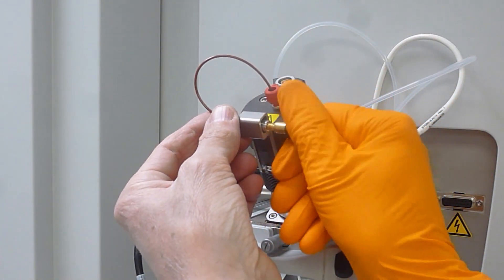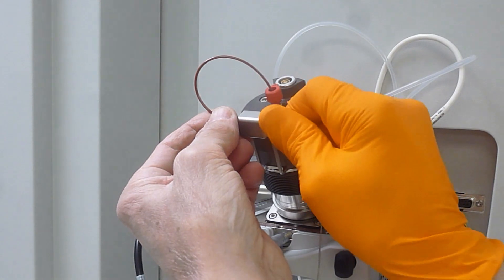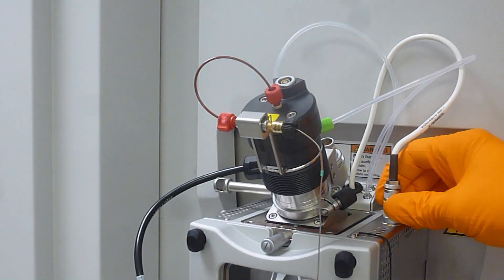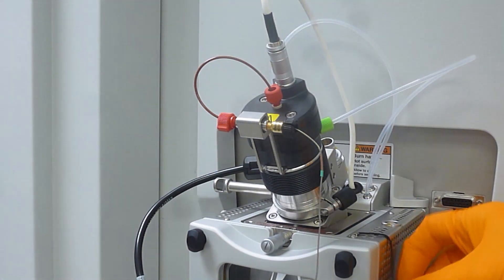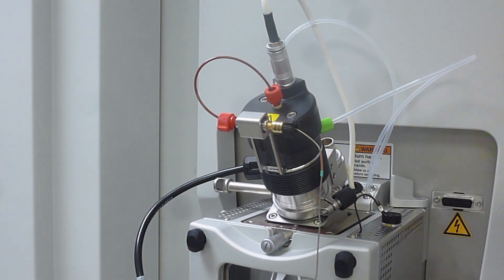Then fit the LC connection, the Viper connection. Now take the HV cable and insert it in the top of the probe and put the little cap back in to keep the socket clean.